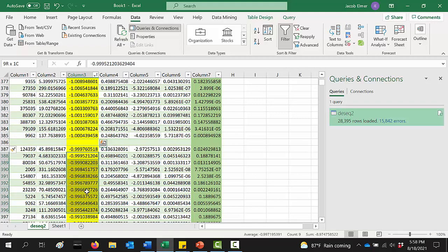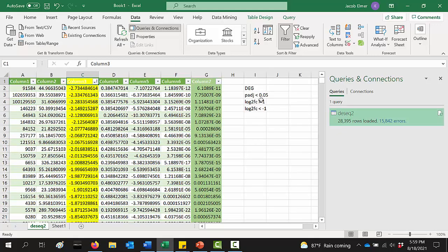These genes were downregulated too, but it was at less than 2-fold of a difference. So I'm not really confident that that small of a decrease, even though it's significant, would have an effect on the cell. Okay? So those are the thresholds we use to define what our DEGs are. Okay? So you want to do that, and then you know what your differentially expressed genes are.